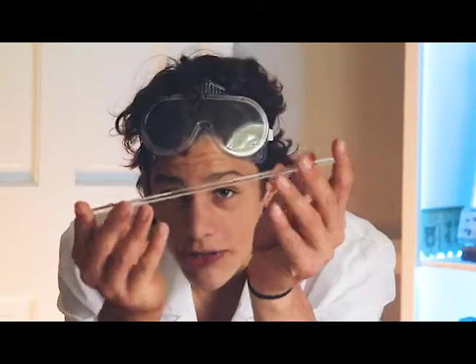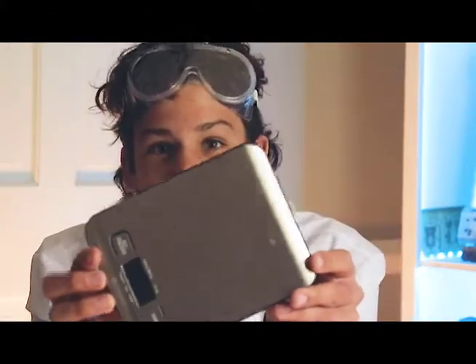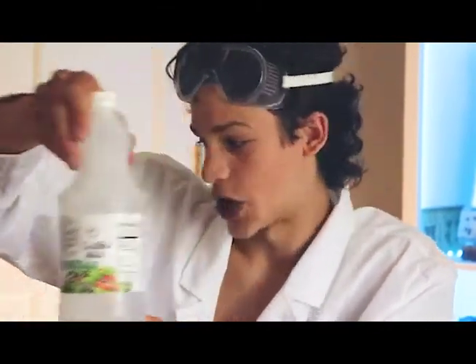You're also going to need a stirring rod — this is a fancy stirring rod, very beautiful. You're going to need a couple of gloves for protection. You're going to need a mass scale that measures in grams, not pounds. And you're going to need some white vinegar — you want it to be clear — as well as a measurement teaspoon.